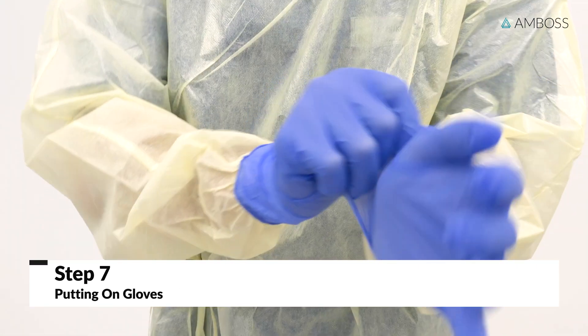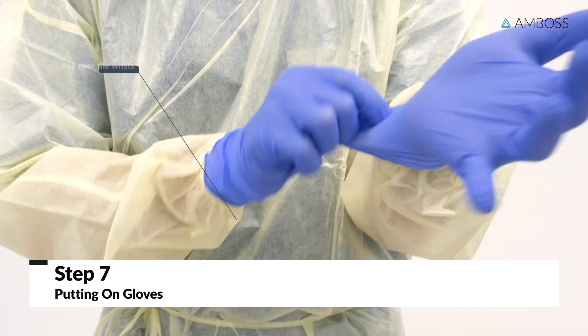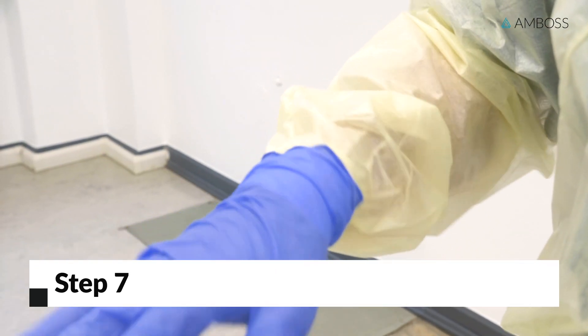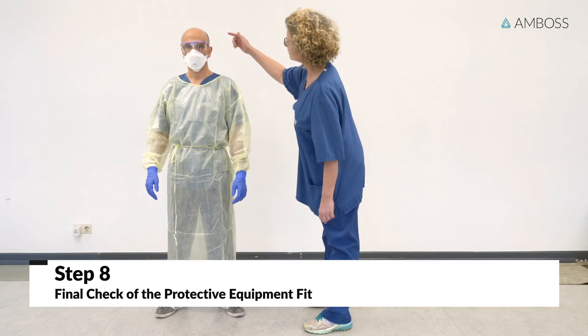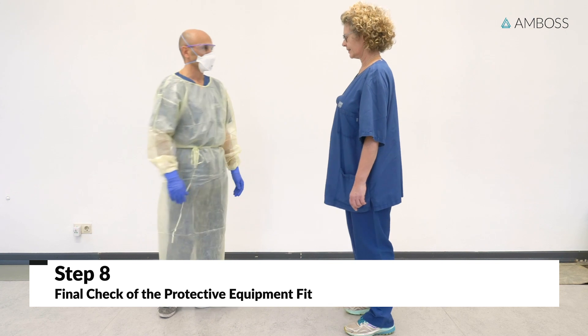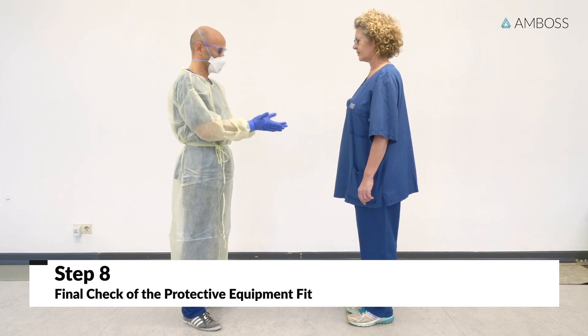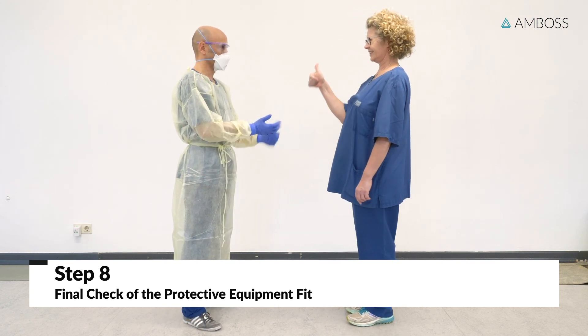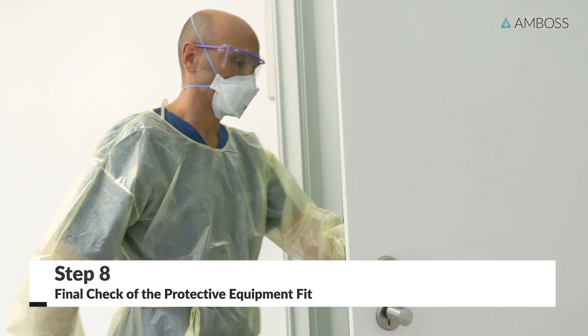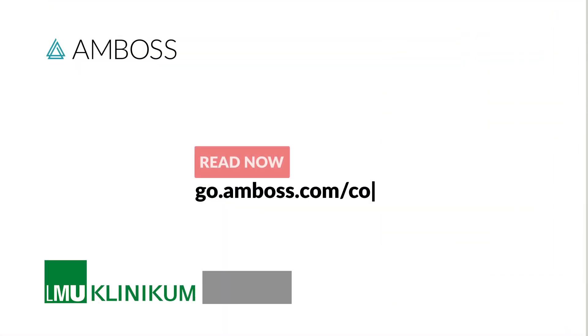Next, put on properly sized disposable gloves. Make sure that the gloves cover your wrists. Before contact with a patient, make sure that the protective equipment fits properly. An assistant can support you if necessary. It is now possible to carry out protected patient contact. Throughout your contact with the patient, always make sure that your personal protective equipment is fitted correctly.